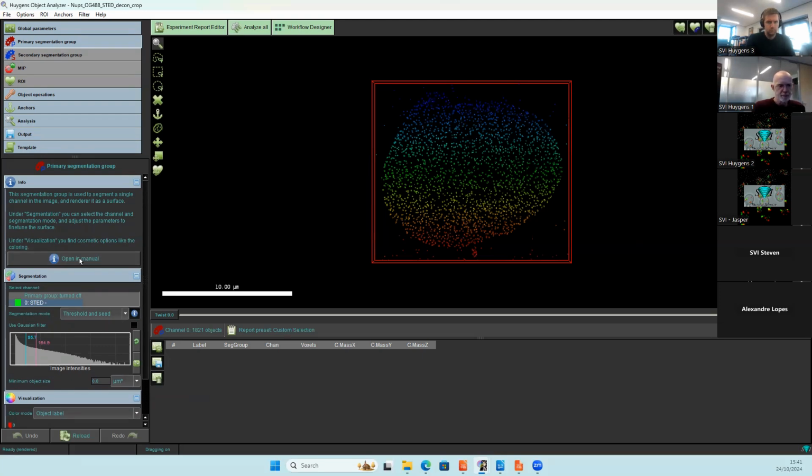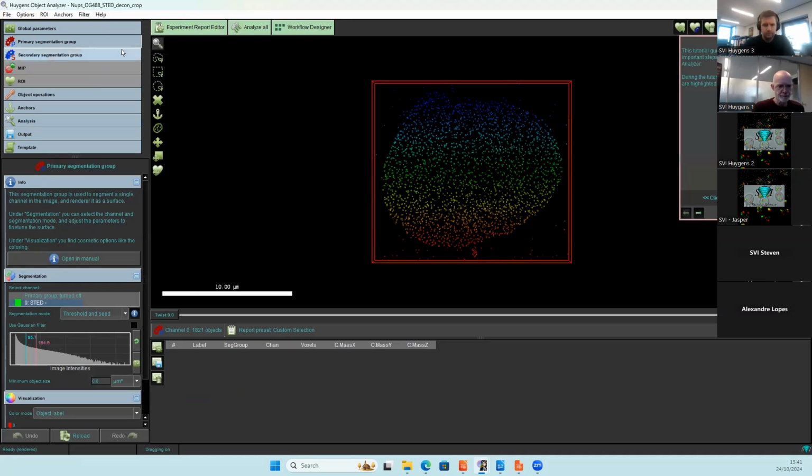And there are other options for help under the Help menu here. There's an online help function. Also here you can open the manual, and we have a couple of tutorials that are built into this tool. And what I'd like to show you now is the basic tutorial tool.